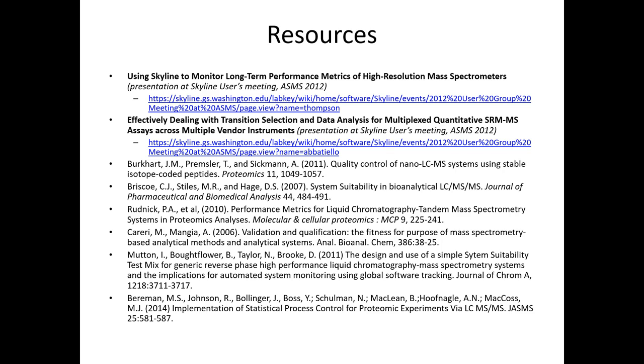There are a lot of people that have small variations on the same type of system suitability, and if people need pointers, what I have is not vendor specific. It'll work on any platform. Although they are Thermo products, you can get variations on those too.